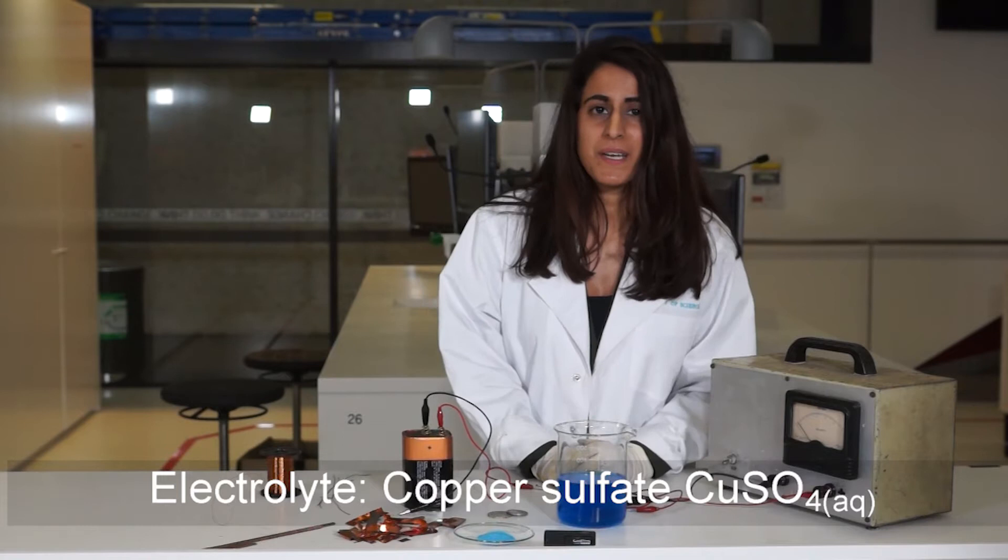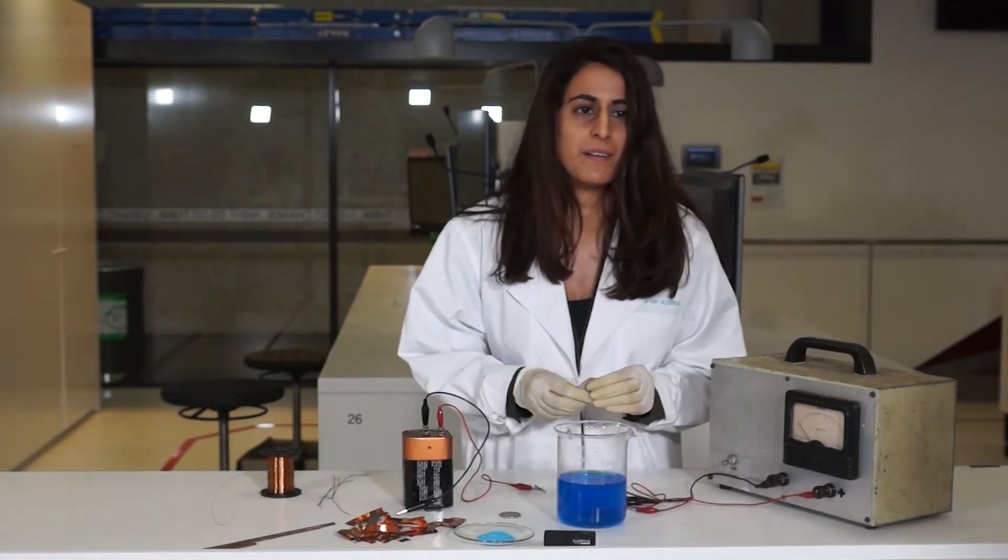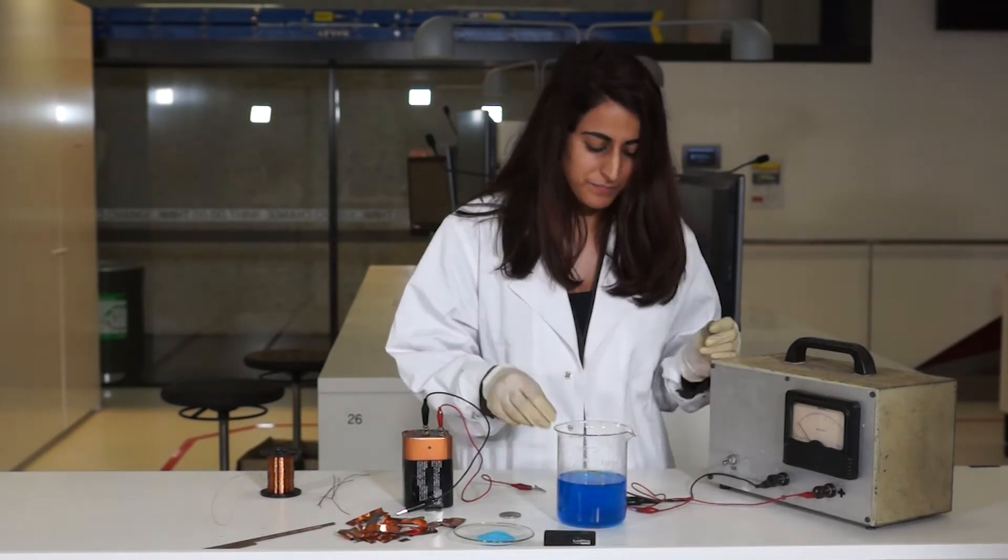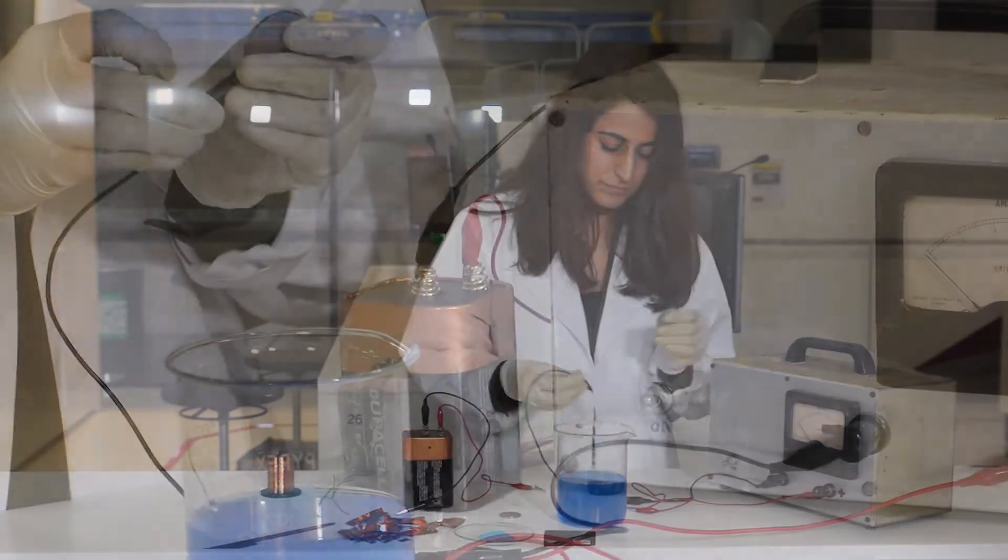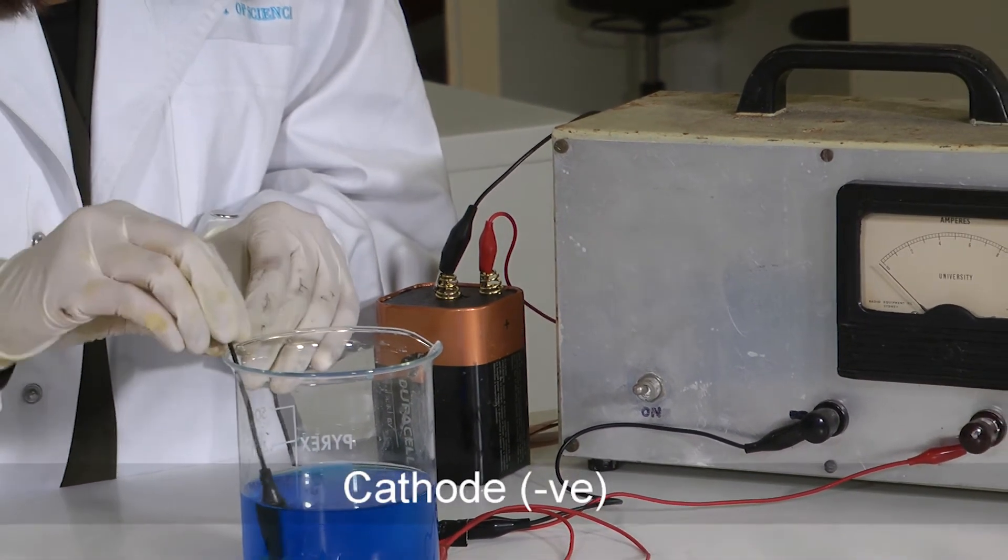And now we need a material which to electroplate. Let's use this 40 cents coin. We're going to connect this to the negative terminal of the battery, and this is called the cathode.